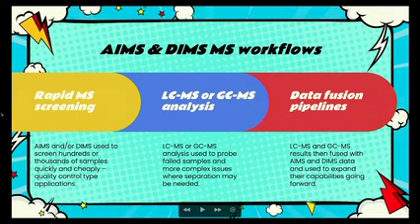Where it fits into a workflow, I would suggest, and this is a good starting point, obviously once you have your own applications and your own development, I would encourage you to go your own way on this. But do a rapid screening first and get hundreds or thousands of samples through.